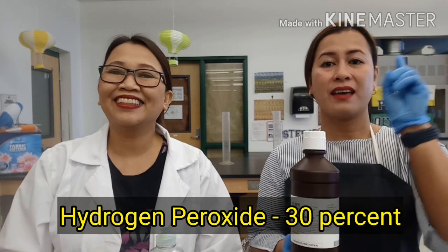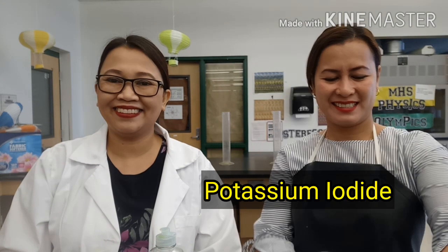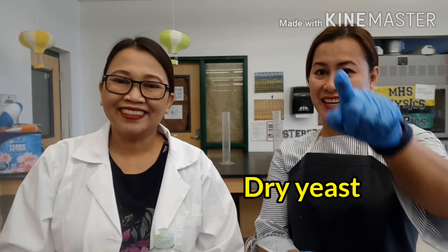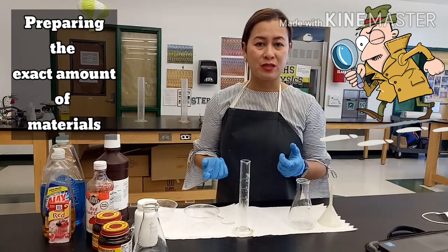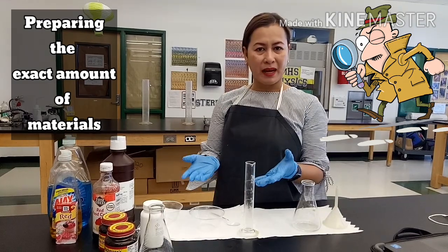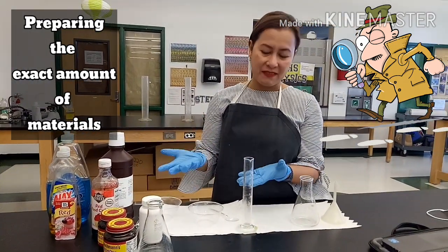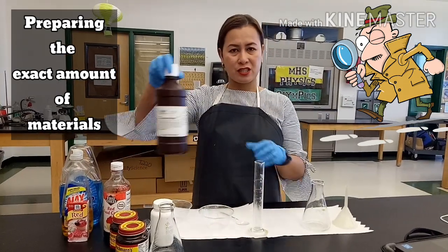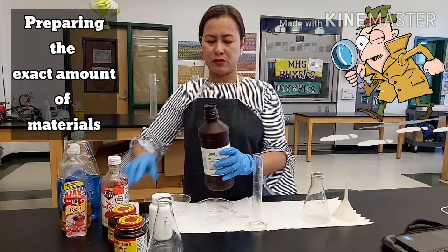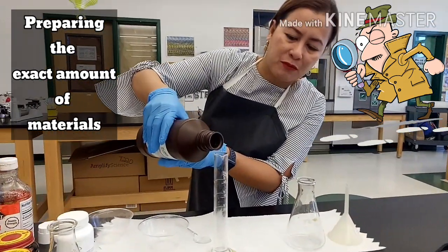Hydrogen peroxide, 30%. Potassium iodide. And dry yeast. There you go. What we're going to do first is make sure that you have an exact and precise amount of your liquids or any of these materials before you start your activity. So let's have first the hydrogen peroxide. As I have said, we're going to follow safety lab rules so that we could eliminate having troubles while performing it.